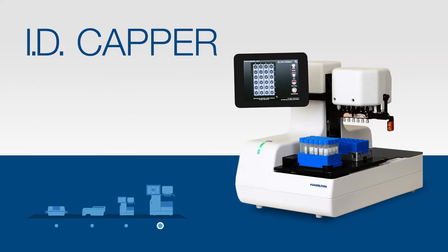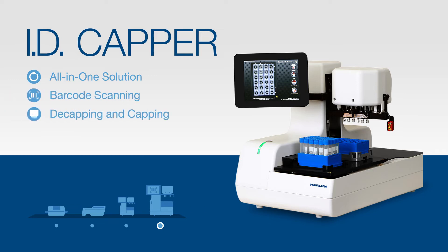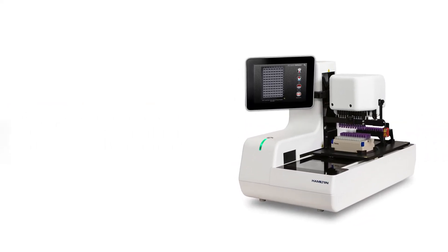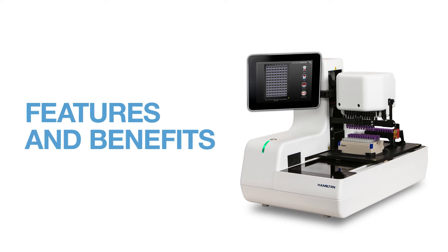Our final product in the LabElite family is a crowd favorite, the LabElite ID Capper. The ID Capper essentially combines the ID Reader with the Decapper for an all-in-one solution. The ID Capper provides all-encompassing technology that allows you to scan barcodes, decap, pipette or move to other automation and then recap. Now that you have a better understanding of all our LabElite products, we'd like to take a closer look at our Decapper by reviewing the features and benefits and demonstrating the functionality of the device. So let's jump right into it.